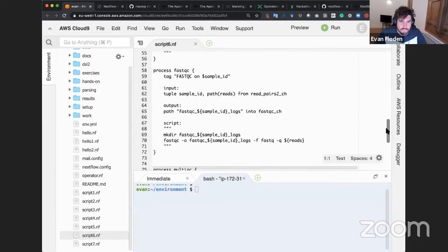The thing to note about how MultiQC works is it takes the output or the logs or the results of many different bioinformatics tools, something like 80 or 90 of these tools. It's able to take the output from them and generate a report. Now, imagine that I have run 1,000 samples or 10,000 samples across many different tools. I don't want 1,000 or 10,000 PDFs or HTML reports. It's going to be completely useless to me.